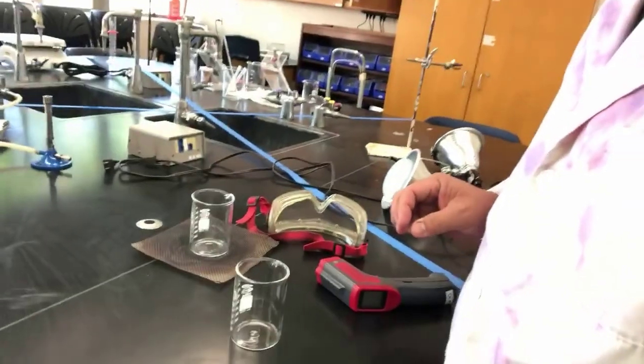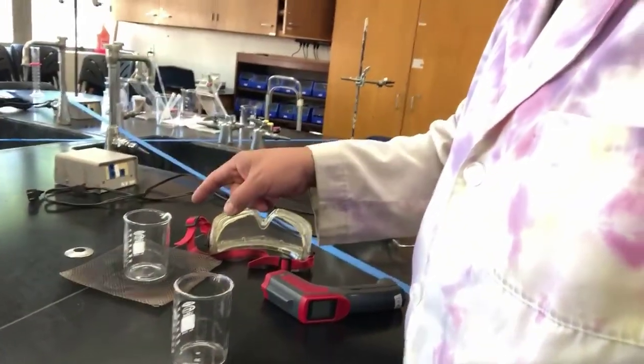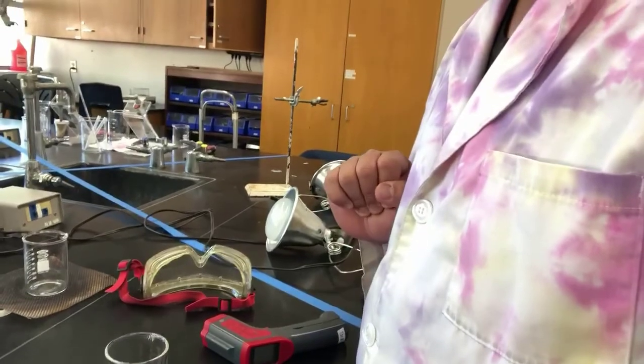And if you're heating glassware, and we do this often, we take equipment and we heat it up to get water, moisture, and impurities off the glassware. Just make sure that you put it in a designated place. We often have wire gauze, and I'll show you what that looks like. All right, and if you have something that's really hot, you can take it and set it on there, and that can be an indication to people that that's the hot one, this one's not. People should know not to touch that because somebody just heated it up so that it would cause a burn if somebody were to grab it. And also, if you don't want people to steal your glassware, it doesn't hurt to just stick it on there. Okay, so there you go.